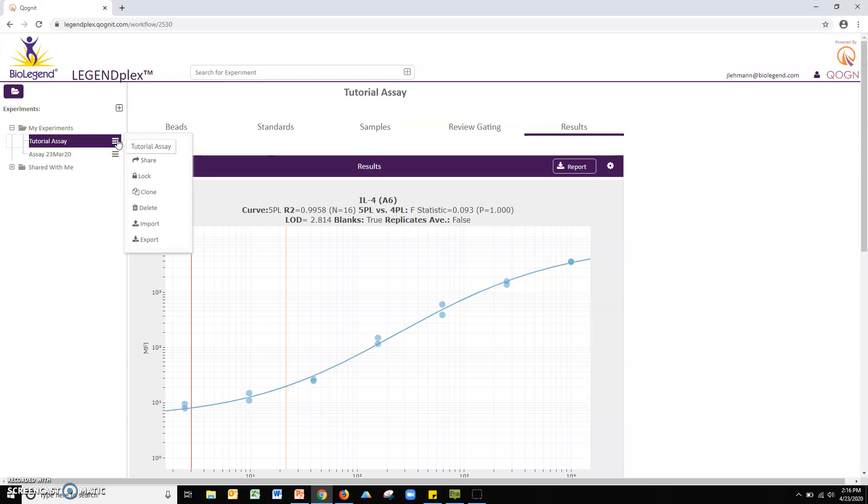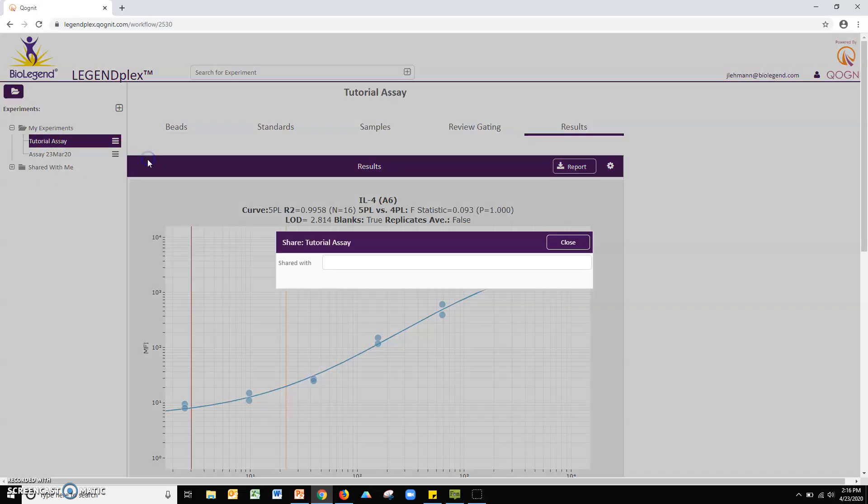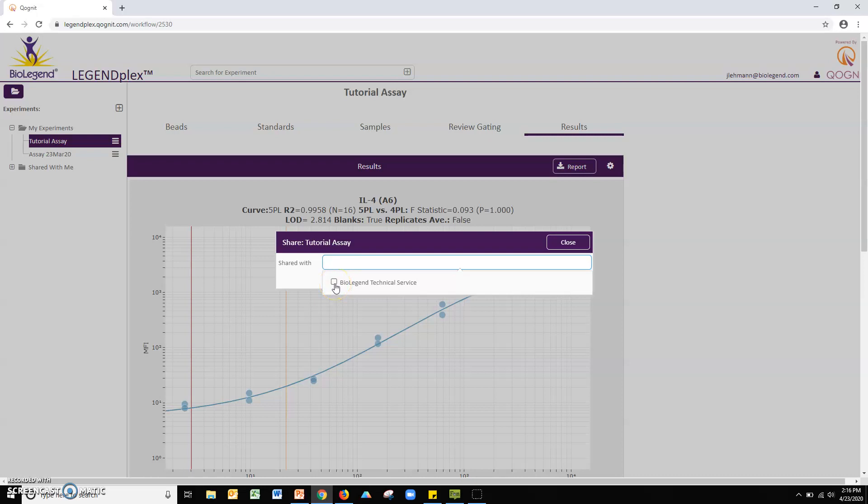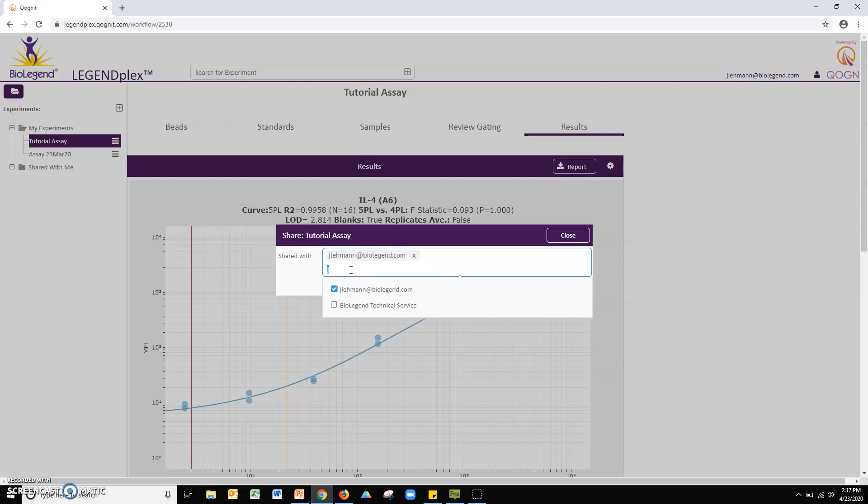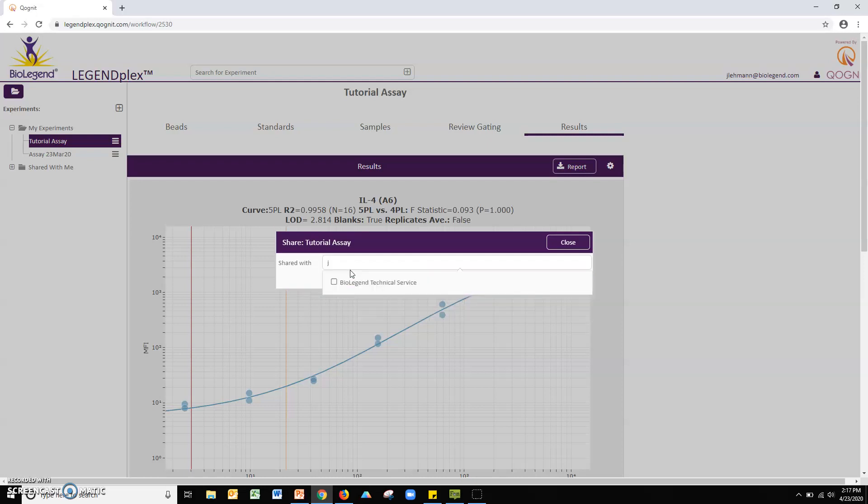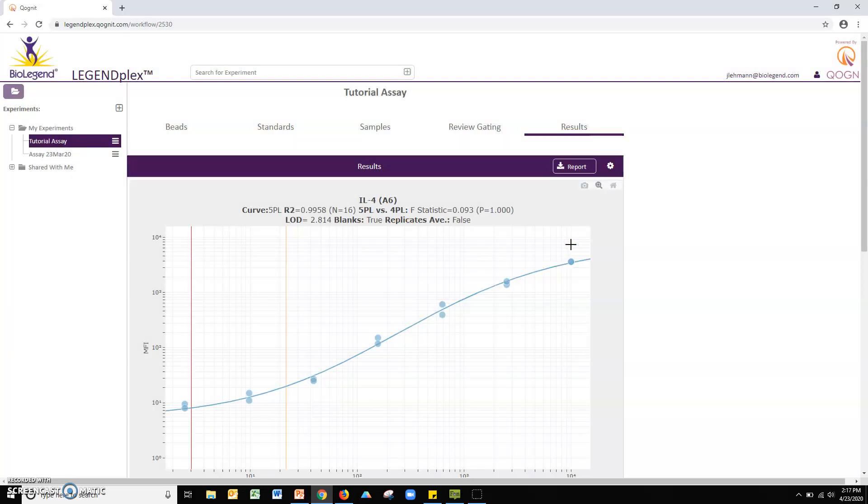Click share and then click the text field. If you would like to share your data with BioLegend's Technical Service, simply check the box now visible. If you would like to share your data with another user, type their account email address into the field and hit enter. The software will automatically send an email to the user informing them that you have shared your data. You may unshare data at any time by repeating this procedure and clicking the X next to an account you have shared data with.